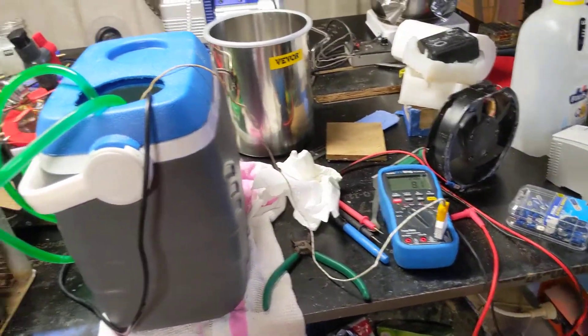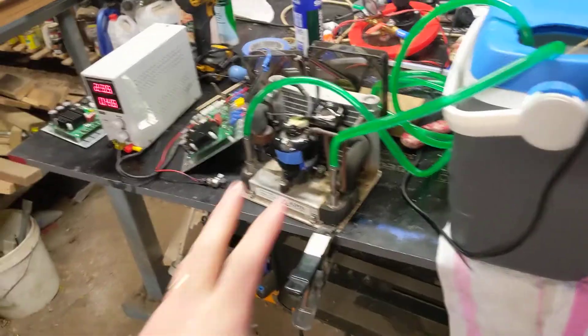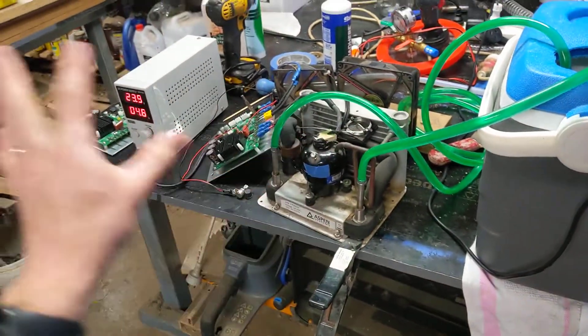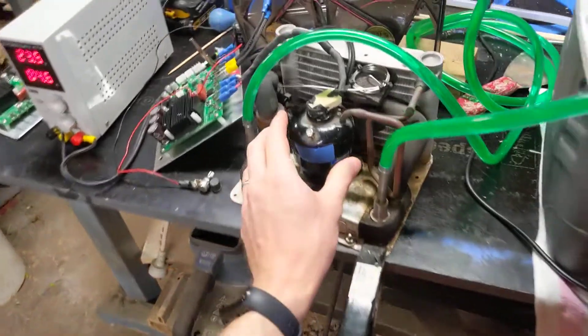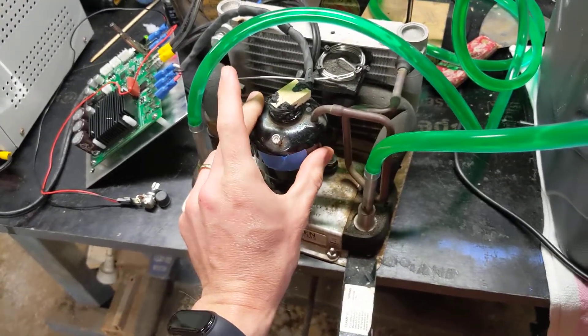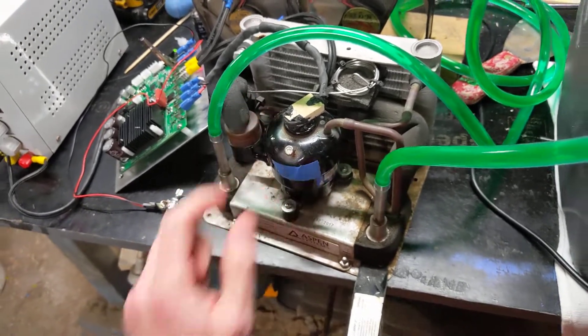I'm just going to keep an eye on this for a while, see how low it gets, see if anything fails. These are a bit fiddly, but I seem to have found a combination of settings and specific units that gets it up and running. These run real hot — according to the data sheet they can run up to 100 degrees. This one's at about 60 at the moment.